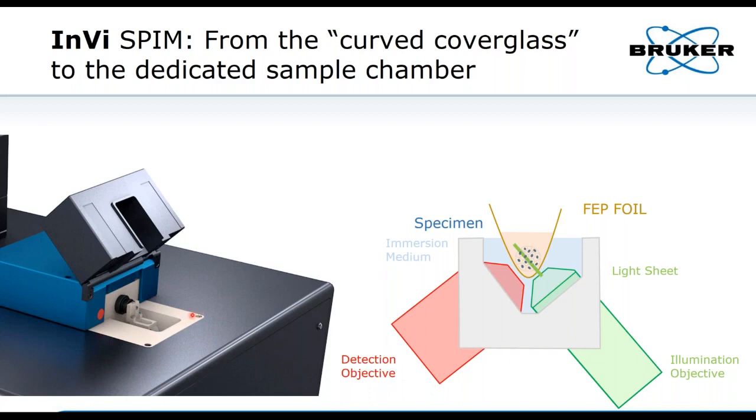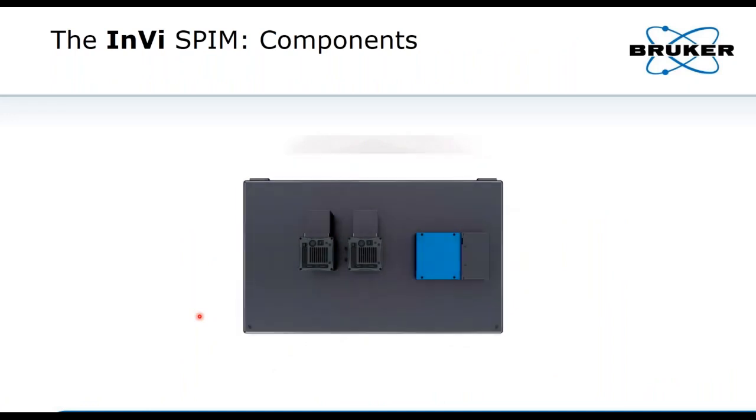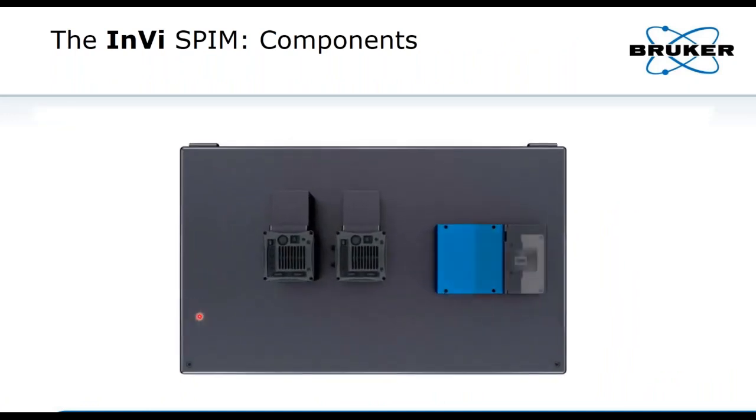You can also provide the right CO2 and the right oxygen concentration for the sample to develop properly and to survive. This allowed then long-term imaging of these mouse oocytes. I will show you a couple of images in a minute. Conceptually, the system is detection-wise a quite conventional one.